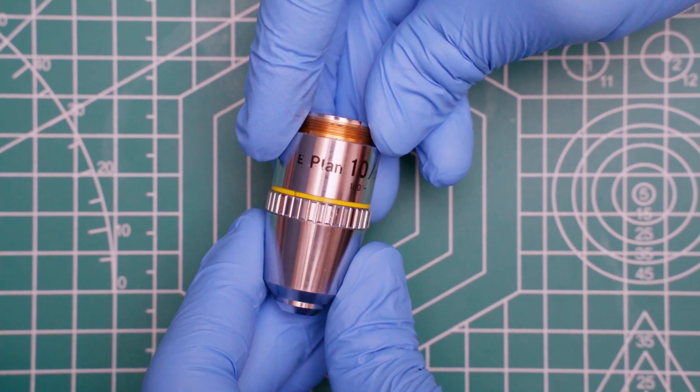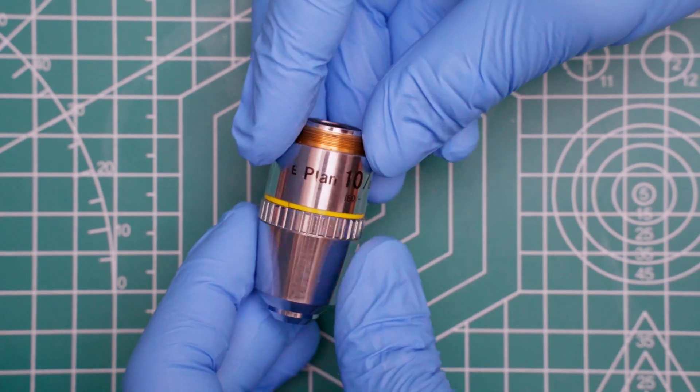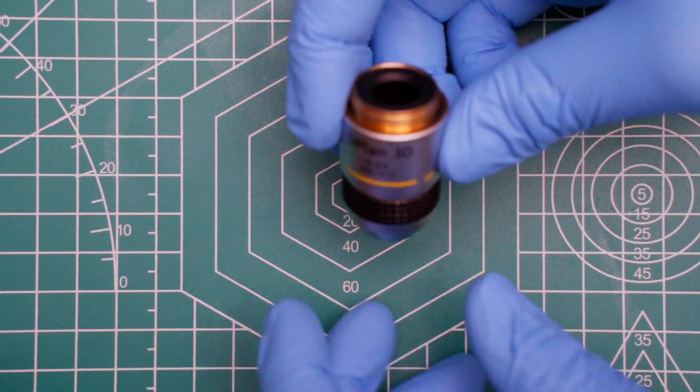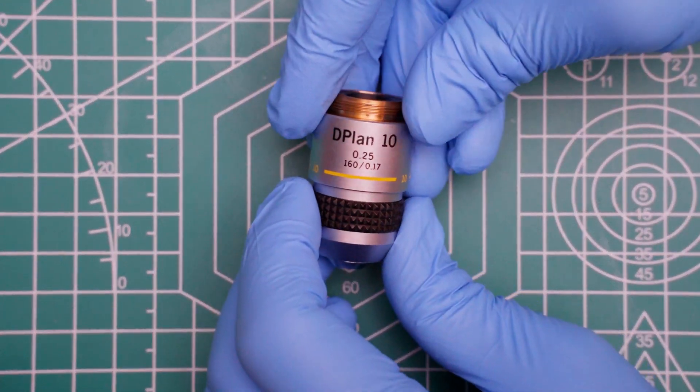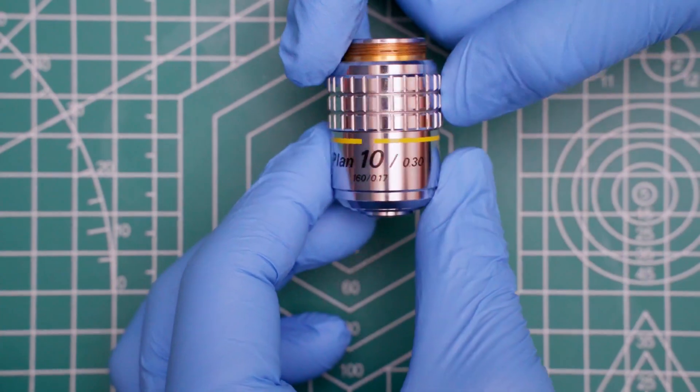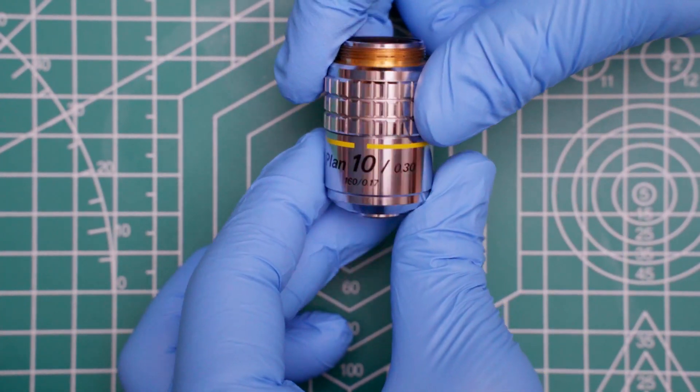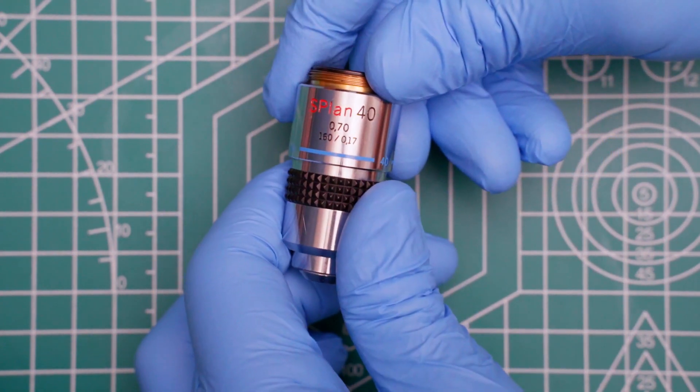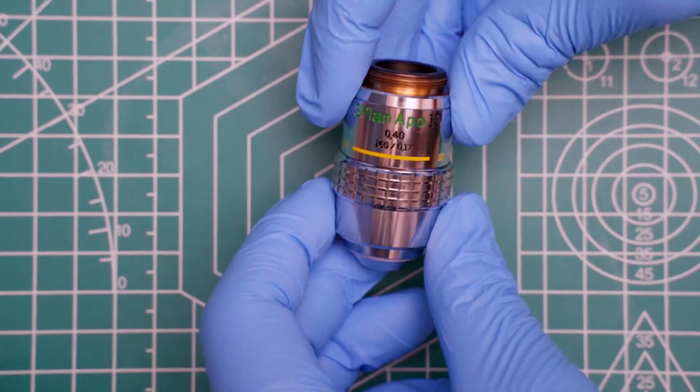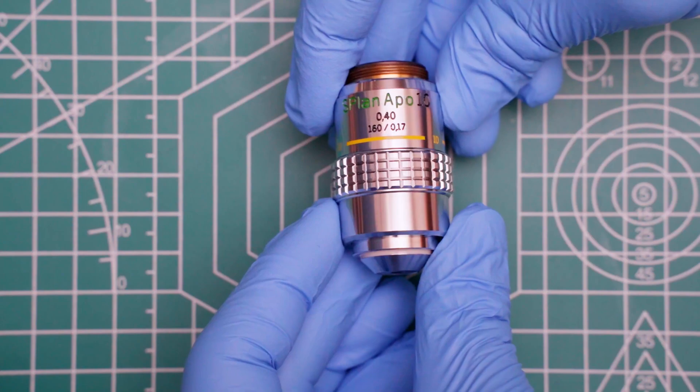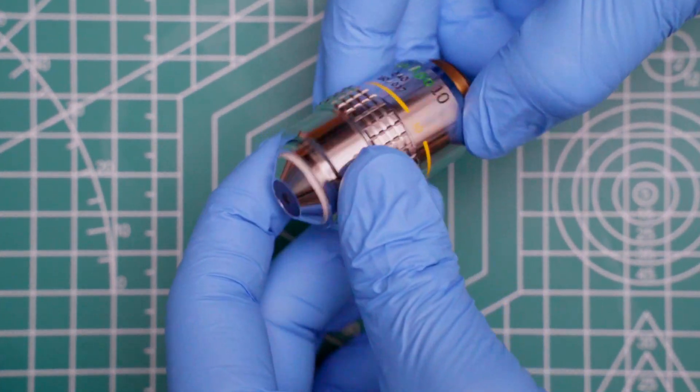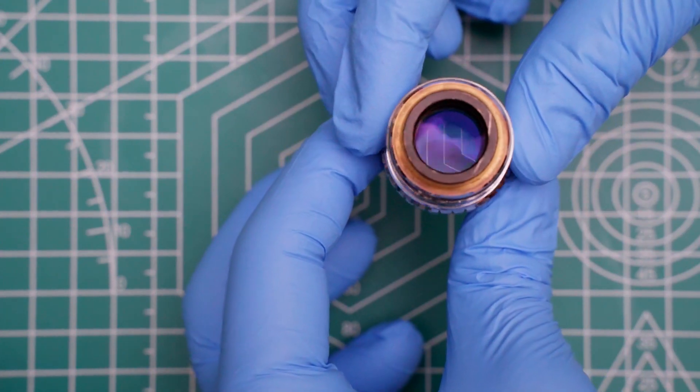The low-end plans can be found for modest prices and will generally achieve the same level of detail as your current objectives, but be less blurry out towards the edges. The high-end plans will achieve slightly better detail and have just generally overall better corrections and contrast. And the high-end plan apochromats will afford you substantially more detail with exceptional color accuracy, although somewhat less native contrast than achromats.